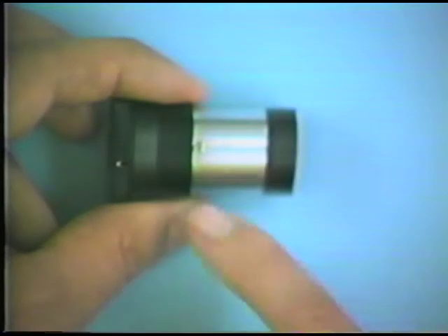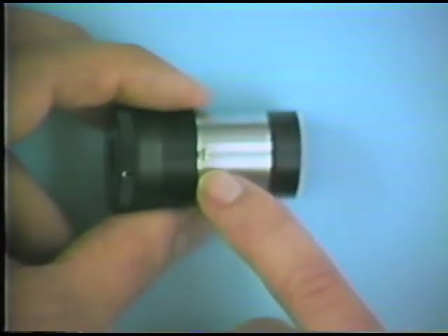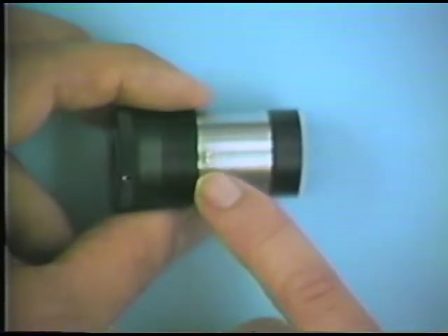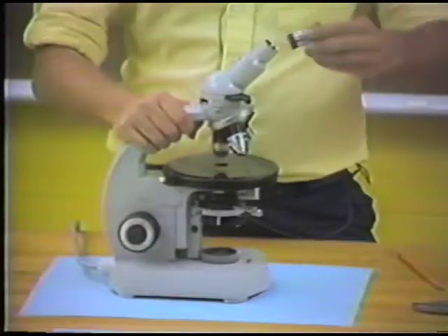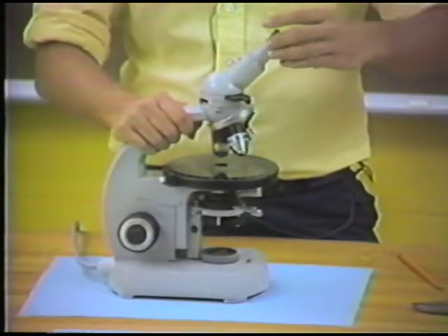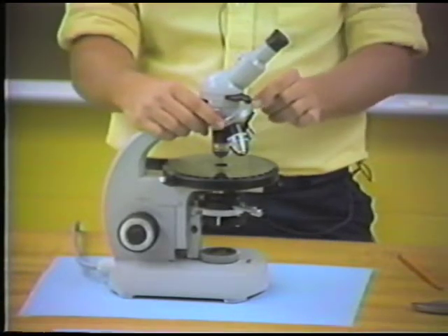Another piece of the ocular is a small screw which serves to orient the ocular when it's put back into the tube of the microscope. This keeps the crosshairs in a north-south, east-west position, or keeps the grid or the micrometer oriented.